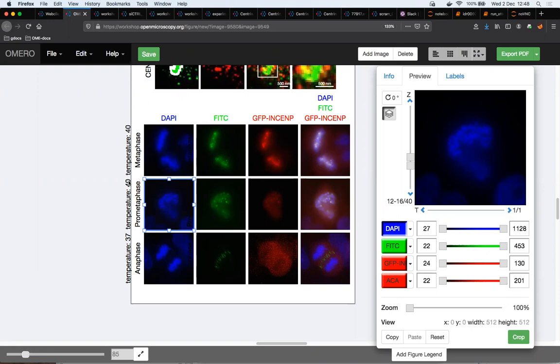You have to select first the correct plane, then export this plane, put it into Adobe Illustrator. By the way, nothing against those two softwares. Adobe Illustrator or the Zen are great softwares, but the problem is once you disjoint the workflow chain between those two, as you do when you export stuff plane by plane and then put them into your figure, and then later find that you can't work with that particular Z plane, you have to go back to the Zen software, export another Z plane, and this will lose you tons of time, and of course a lot of working effort.